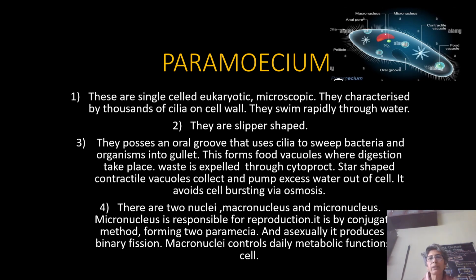Number 3 specimen is paramecium. See students, the figure of paramecium, how it looks. It looks like a slipper shape.